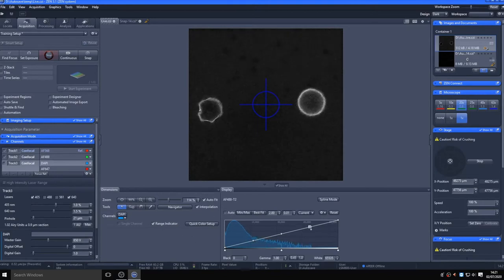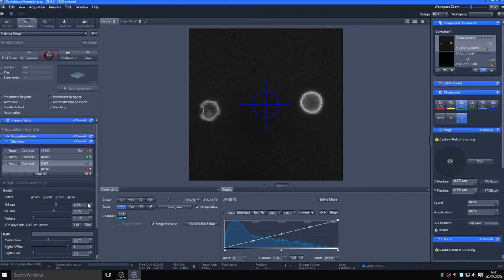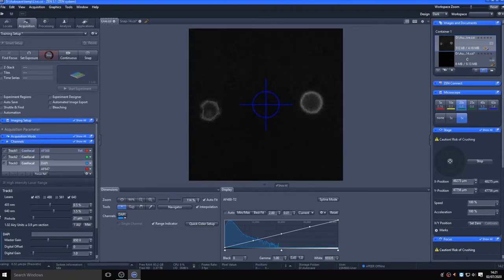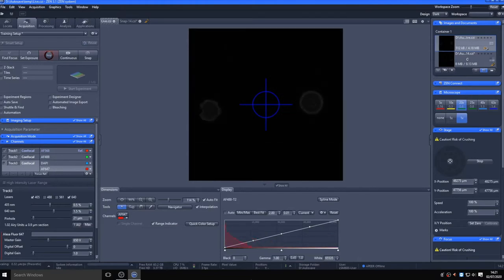If you are imaging several channels at the same time in one track, it is worthwhile switching off each laser in turn whilst imaging both channels to ensure that you are not getting any bleed-through. In the case of this pollen sample, switching off the 405 laser not only loses signal in the DAPI channel, but in the 647 channel.